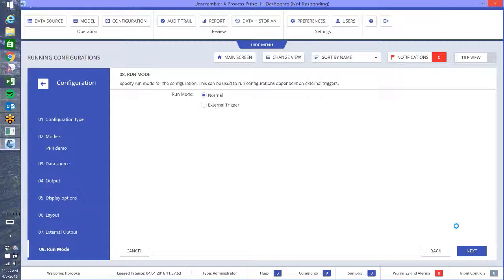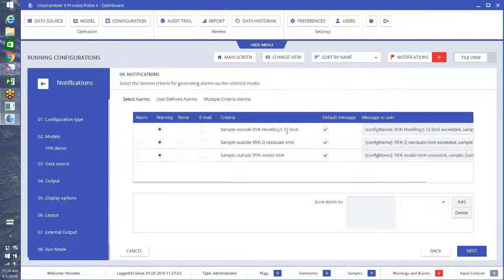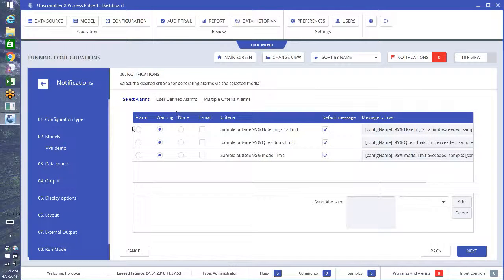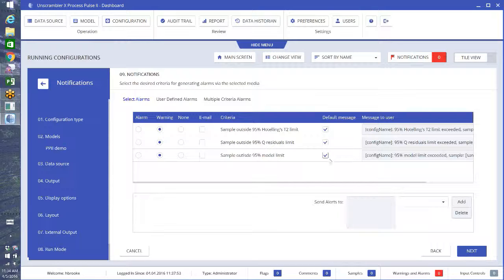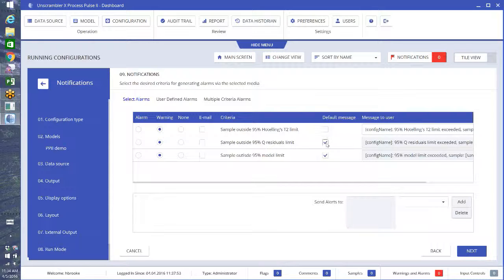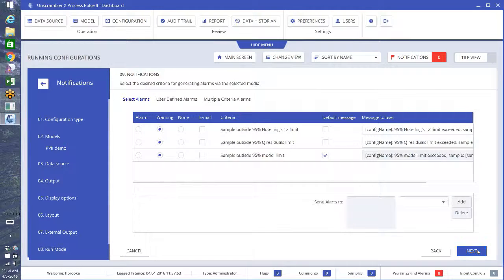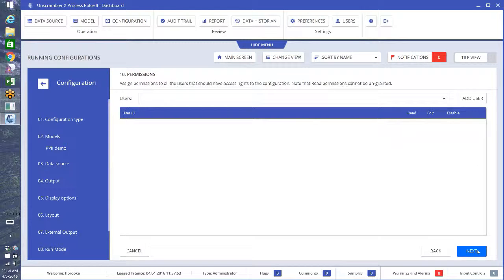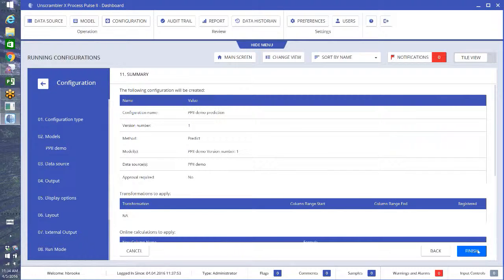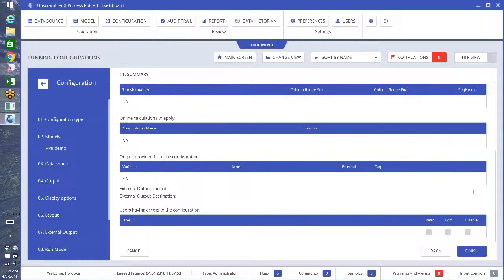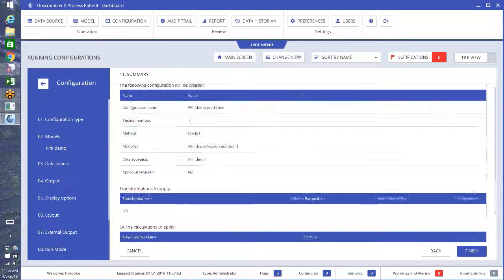I'm just going to keep the defaults for everything, so I'm going to hit next all the way through. Again, I can do some alarms and warnings if I want to. You can send emails to specific people if you want if you have some things that are outside of their limits. I usually just want my warnings for if it's outside the full model limit. Next, and we have our summary again to check to make sure everything is how you want it, and we do finish.